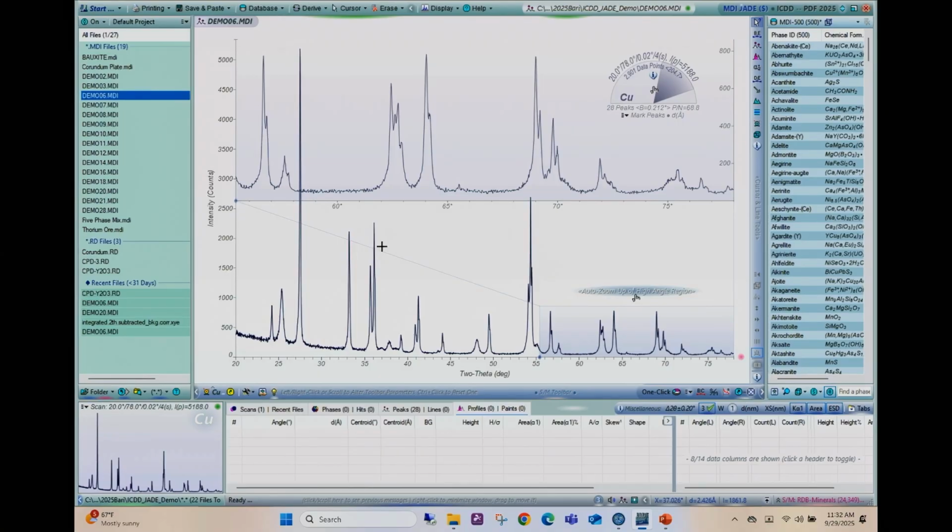So what is generally extracted will be the chemistry, d-spacing data, intensity data, may or may not include the indexing, may or may not include the atomic coordinates, and it kind of stops there. All of that other information, the metadata and things like that, typically is not pulled in, just because it's too big of a file.